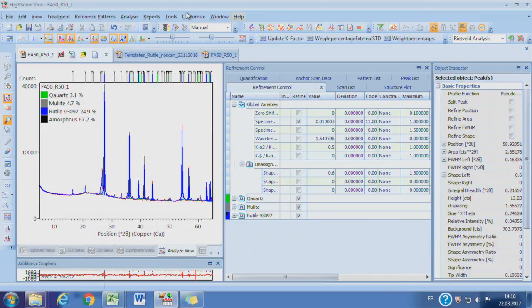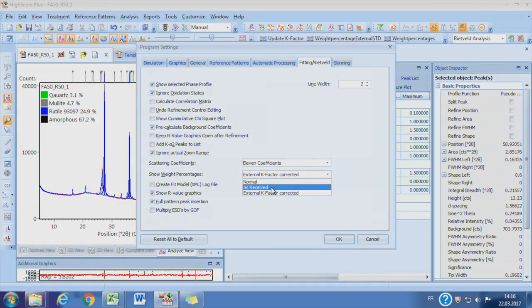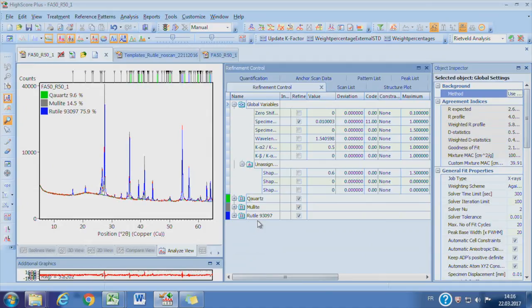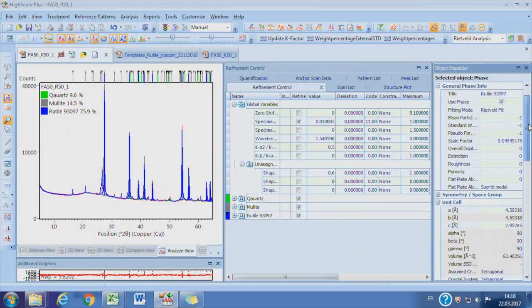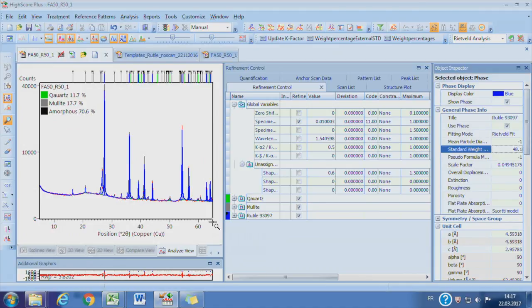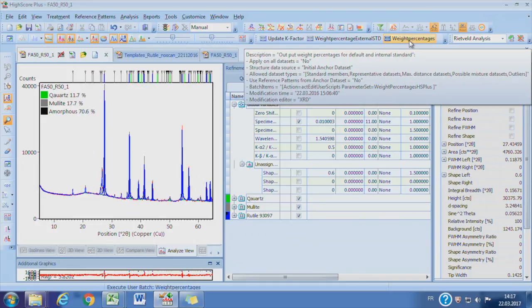To show the results using the internal standard, go to Customize Fitting Rate-to-View panel and change the Show Weight Percentage to As Received. There are three options: Normal refers to the default Rietveld output; As Received means the renormalized internal standard results; and External Key Factor Corrected means the results based on external standard. The last step is to specify how much internal standard was added. Choose rutile in the refinement control and locate general phase information to find the item called Standard Weight Percentage. Type the actual weight amount — here it is 14.8% — and the crystallinity of the rutile used is 99.6%. Now the final results are shown in the analyzed view window.